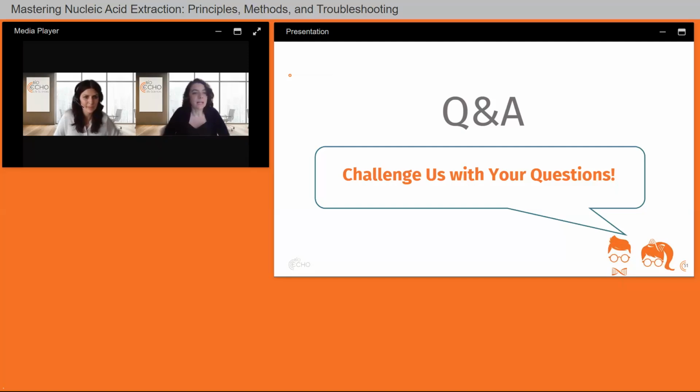Someone asked, this person is performing transcriptomic analysis, and is wondering how the quality of the RNA can affect qPCR and the sequencing results. Very good question, because it covers a lot of downstream applications. The quality of RNA is crucial. For sequencing, obviously, you need concentration and you need a good RIN, meaning intact samples, so big fragments, so that in the end you get nice sequencing results and understand what the sequence is. For PCR, it's not that crucial to have such long fragments, depending on what you're going to see.